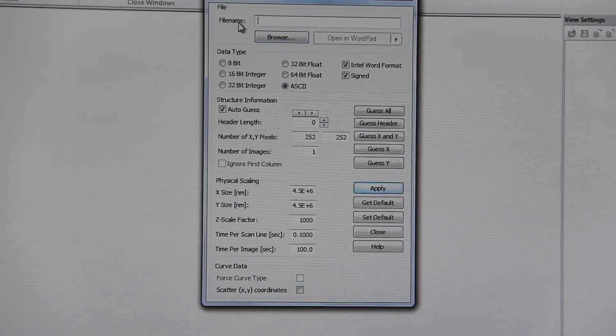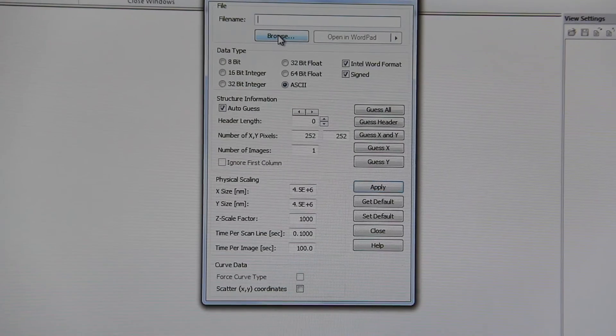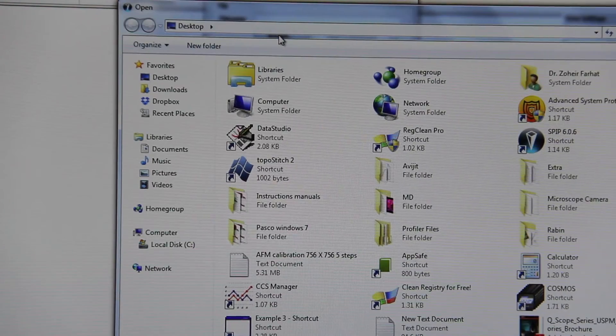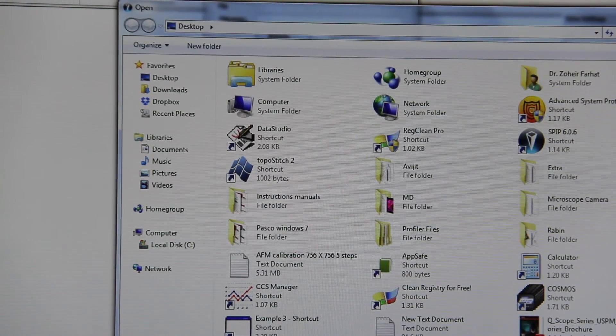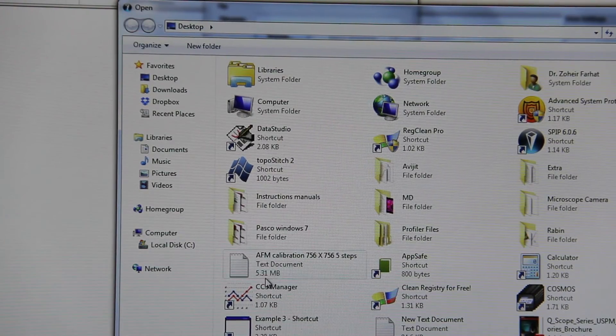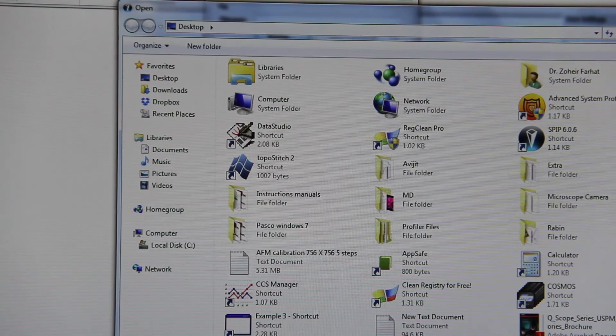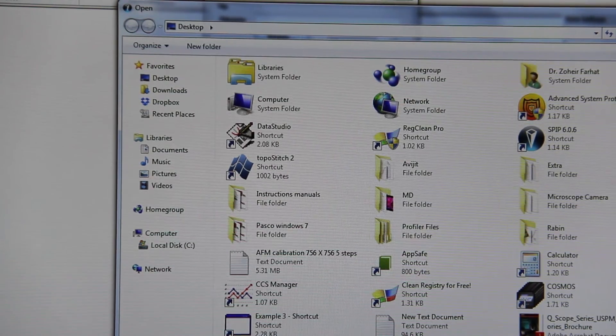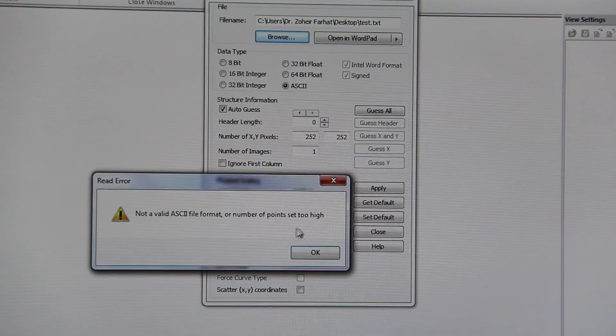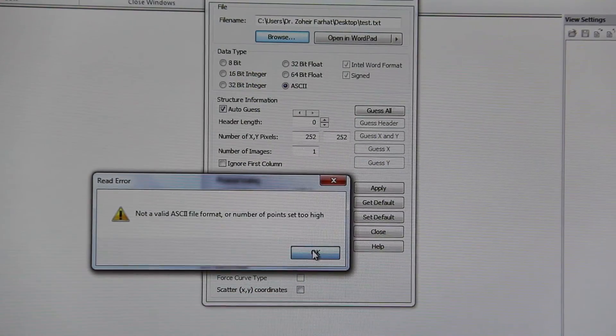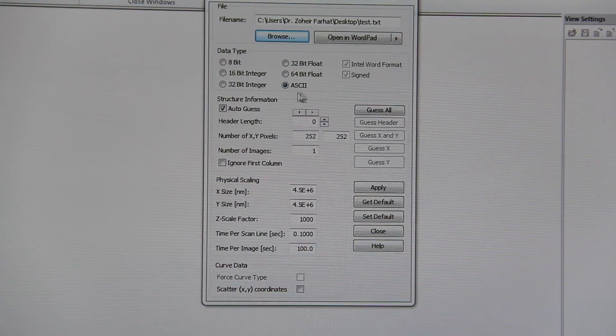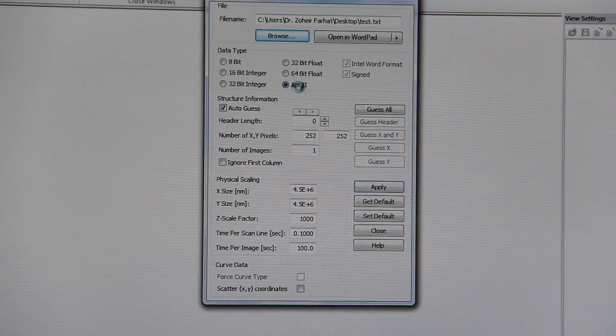In the file name, click browse. Select your file. Select ASCII.